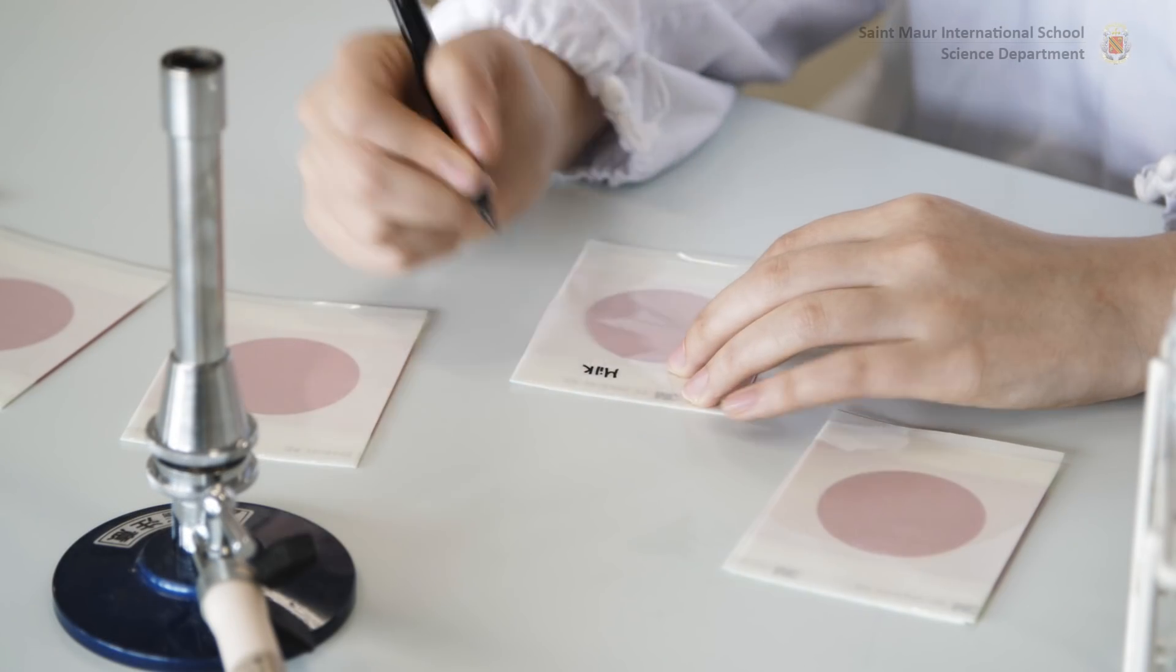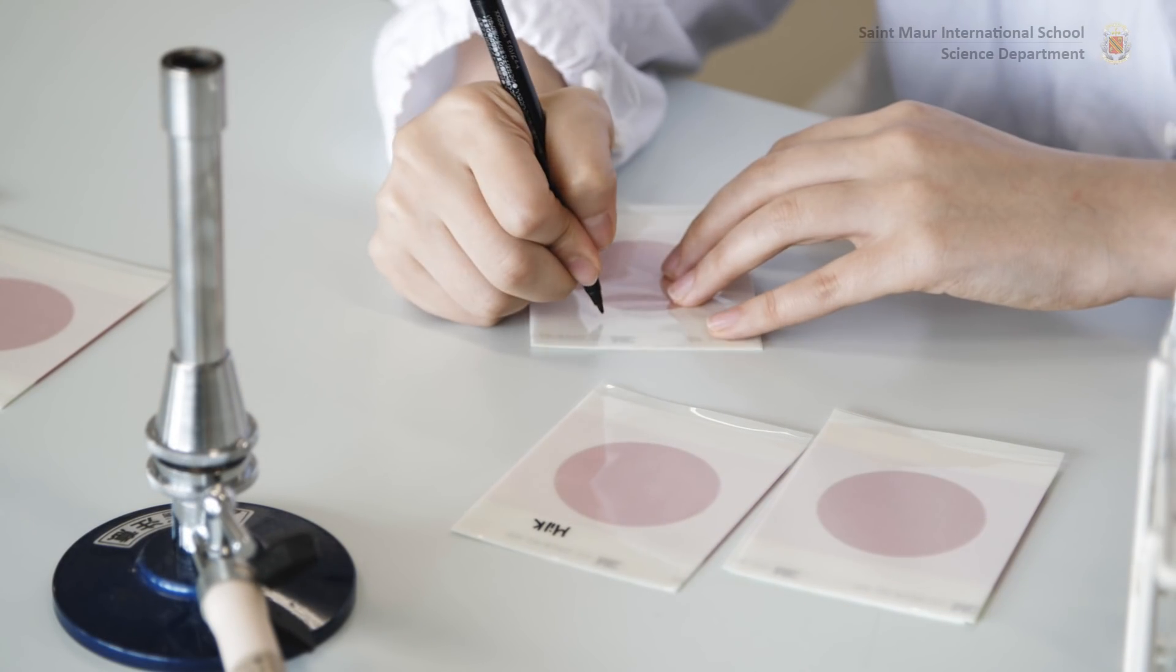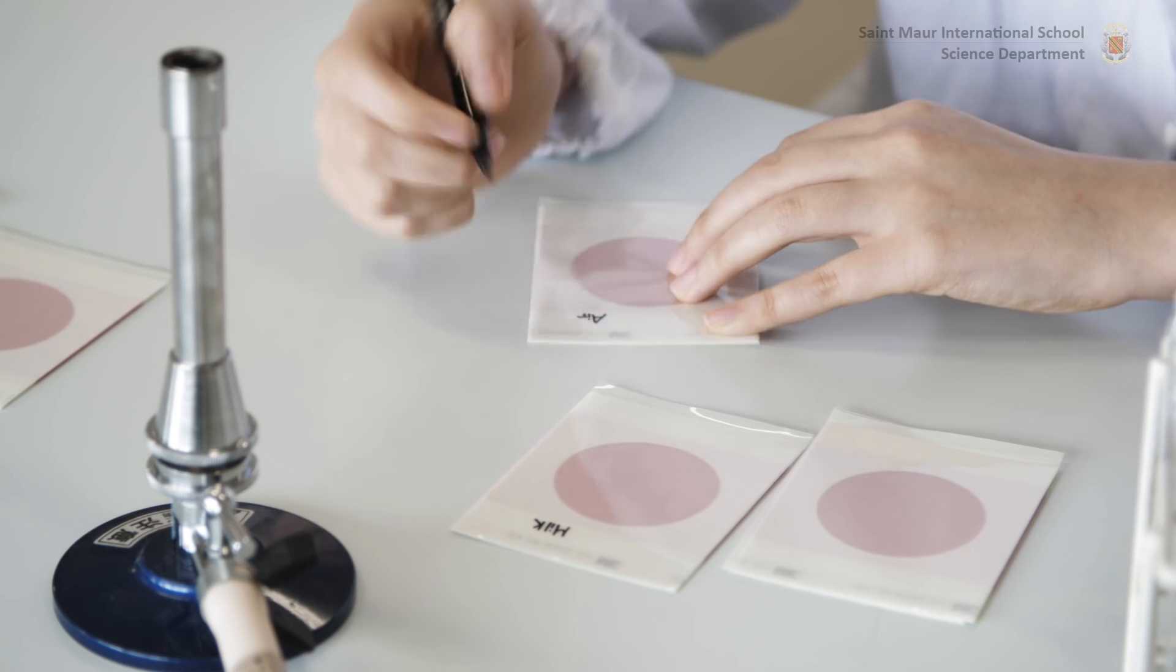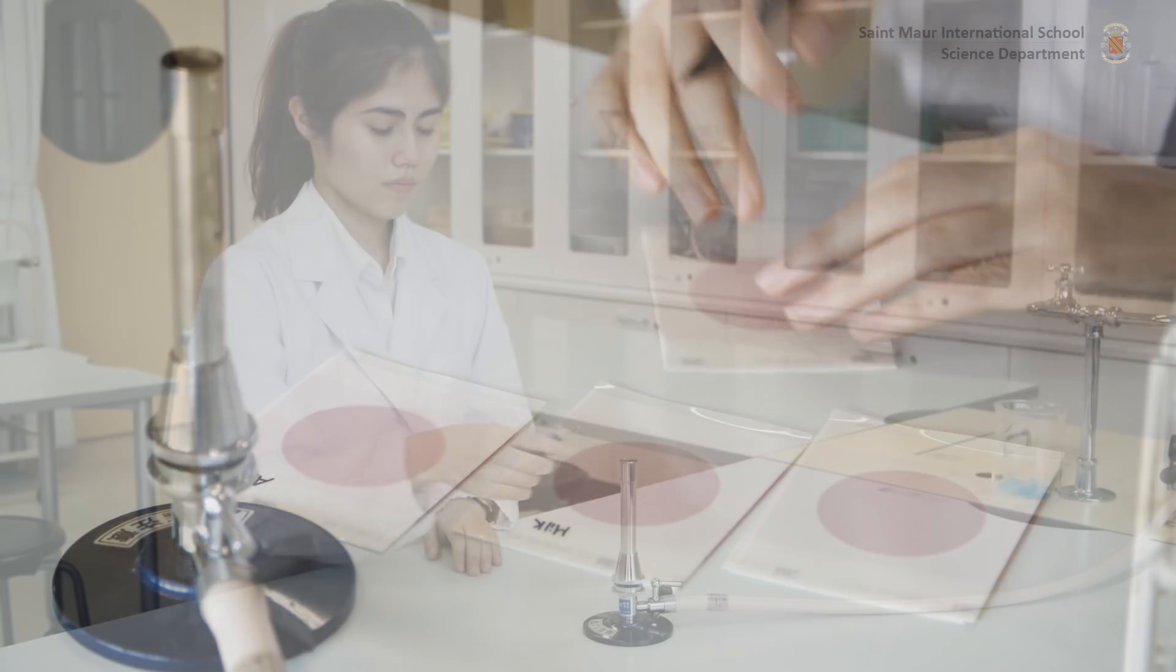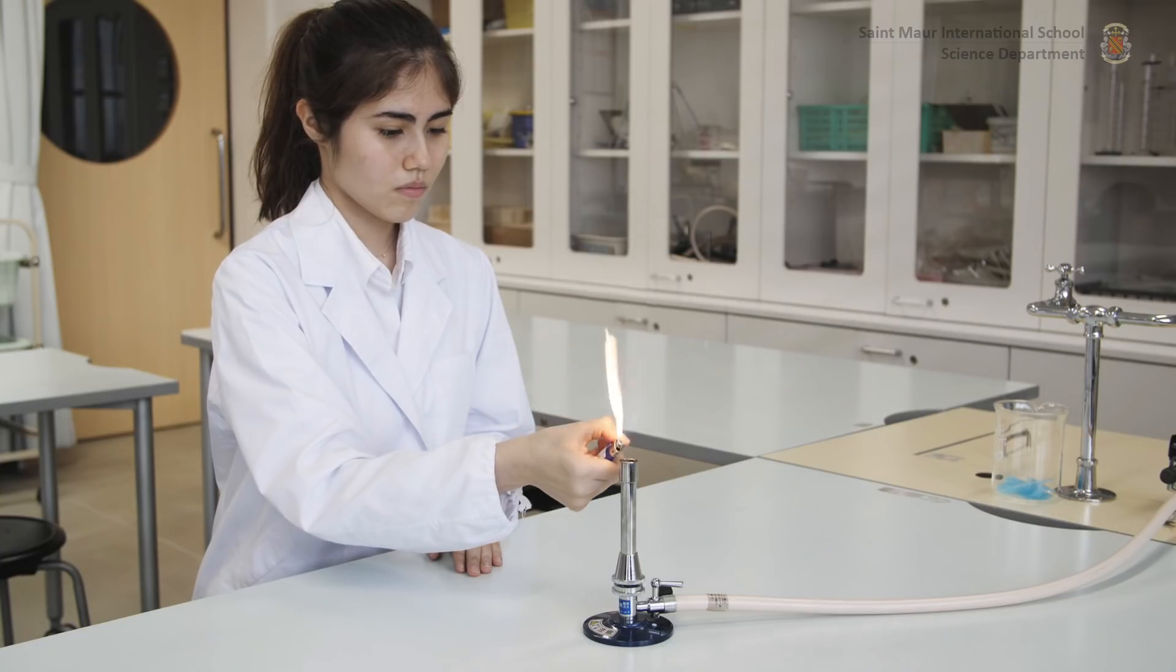Make sure to label the covers of the Petrifilms prior to inoculation. Light a Bunsen burner to establish a cone of sterility.